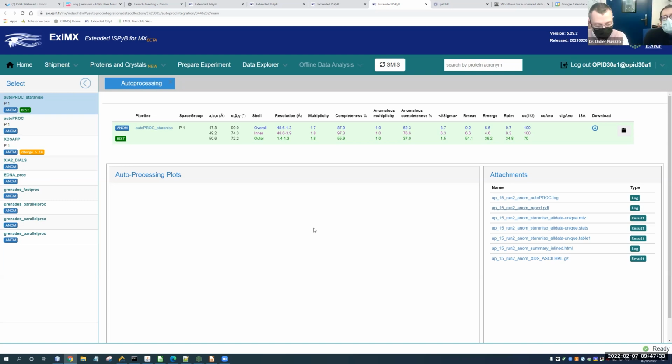Yes, definitely. It's just about the number of spots you've got in the corner, basically. Between 1.5 and 1.3, 80% of the spots are all there, so it doesn't matter very much. The example we show is where the detector was at 2 angstrom and we got 1.3 or even better. A 0.1, 0.2 difference is nothing, or even 0.3. I would say up to 0.5 is all right.